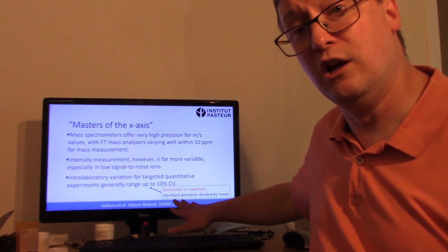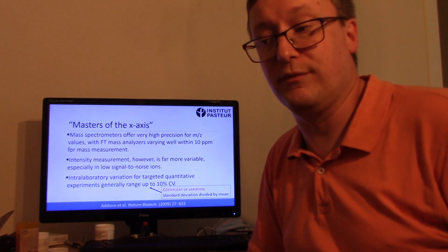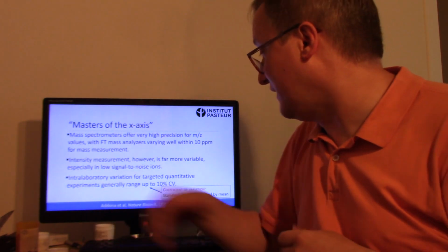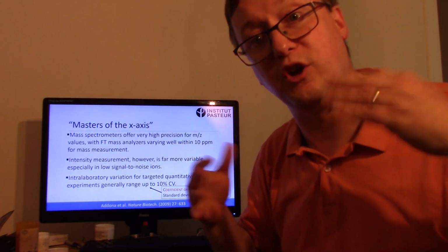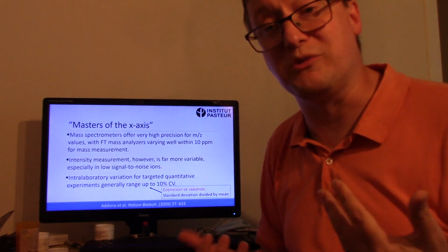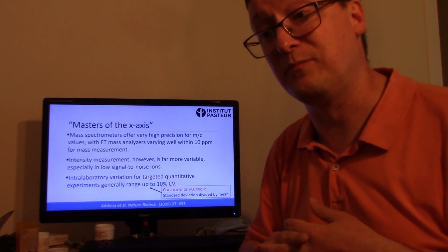Here we're asking, what is the standard deviation for these repeated measurements divided by the mean value for them? In the case of the 10% CV that I'm describing here, you might take a look at this 2009 paper by Terry Addona and friends, which asked how much quantitative variability was observed when we looked at the same sample distributed to many labs equipped with triple quadrupole mass analyzers.